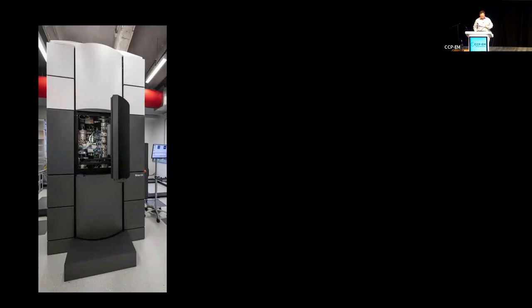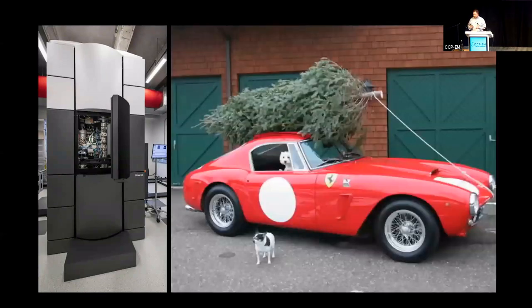But on the other hand, you can look at this and think of it as something like this. In fact, this is sort of how I see a modern, expensive 300 kV cryo-microscope these days. It's a beautiful thing. It has a lot of technology that was developed in it to do things that we don't do in cryo-EM, in single particle cryo-EM for sure. And on a day-to-day basis, it's actually really more than what you want. If you want to come home from the garden center with a Christmas tree, the Ferrari is not the thing you want to drive to do this, right? You want the hatchback or the pickup truck or whatever.